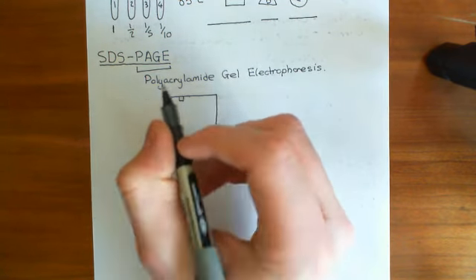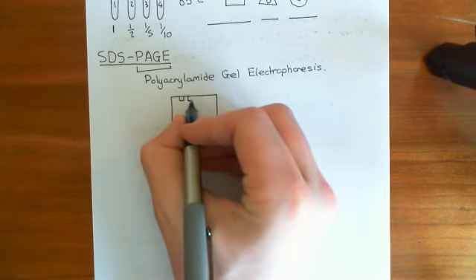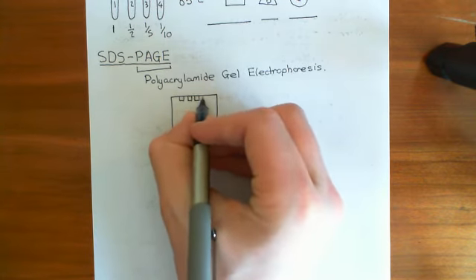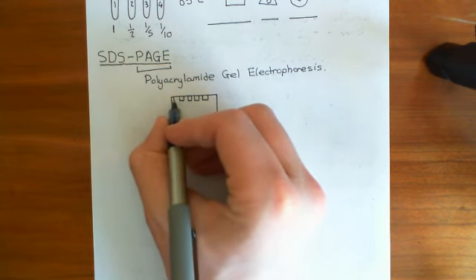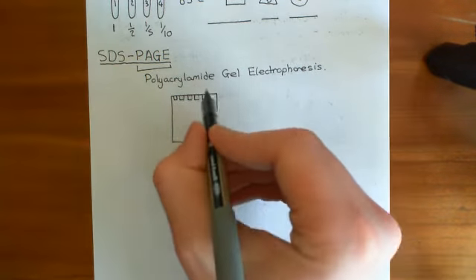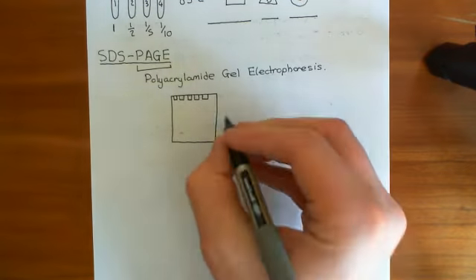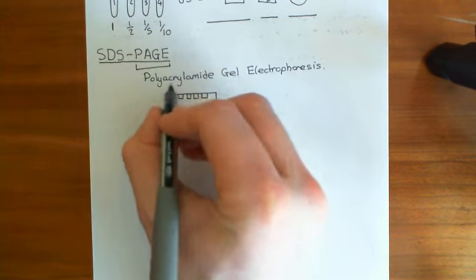Okay, and how many wells are we going to need? We're going to need four for our samples. But we're also going to need some for what are known as ladders, and we'll just have one ladder to make this simple. So we've got 5 wells here. These are just where you load your samples. And this is basically a gel, and it's a polyacrylamide gel.